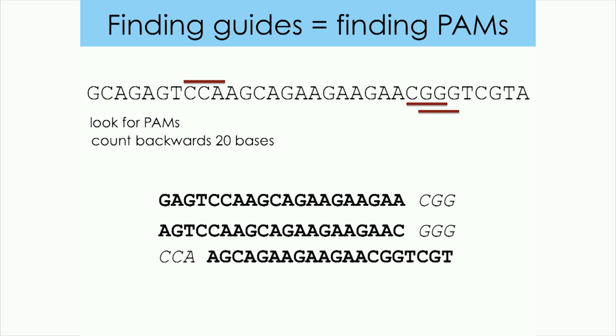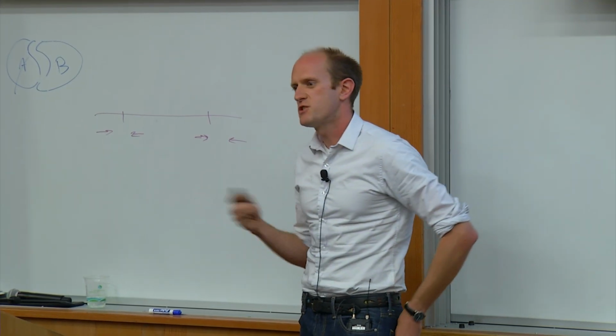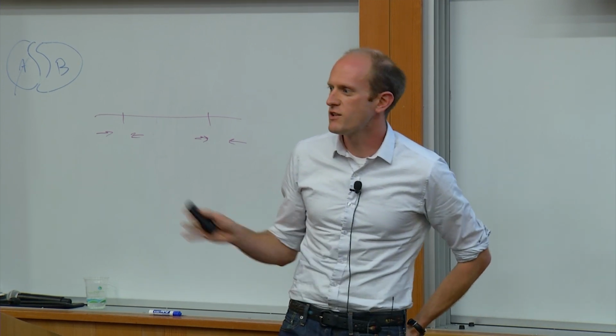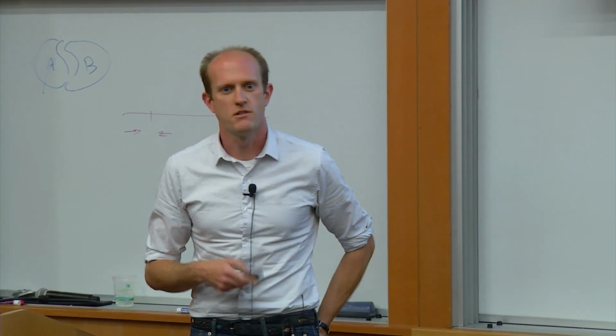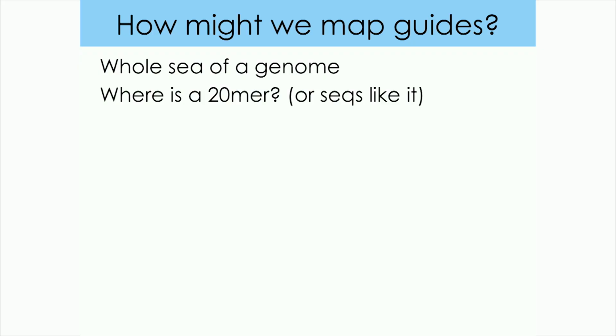This is a potential protospacer, so is this. And here's the one on the opposite strand. You just reverse complement it, and then that's your protospacer for the other strand, right? Whenever you have any kind of web server that's finding guides and spitting out huge lists of guides, all it's doing is a text search for something GG in the case of SpyCas9 and spitting out whatever bases were behind it, okay? So now we've got this huge list.